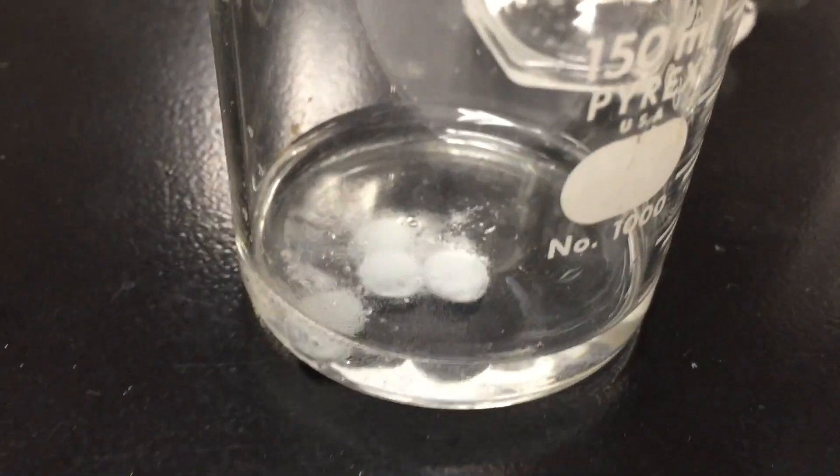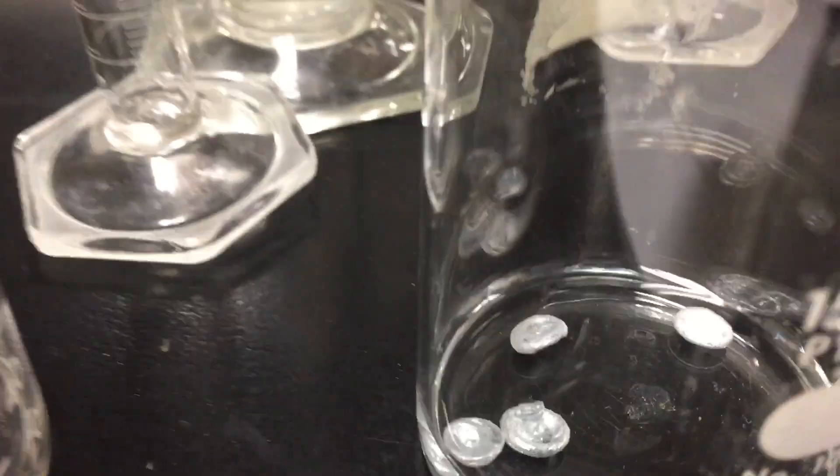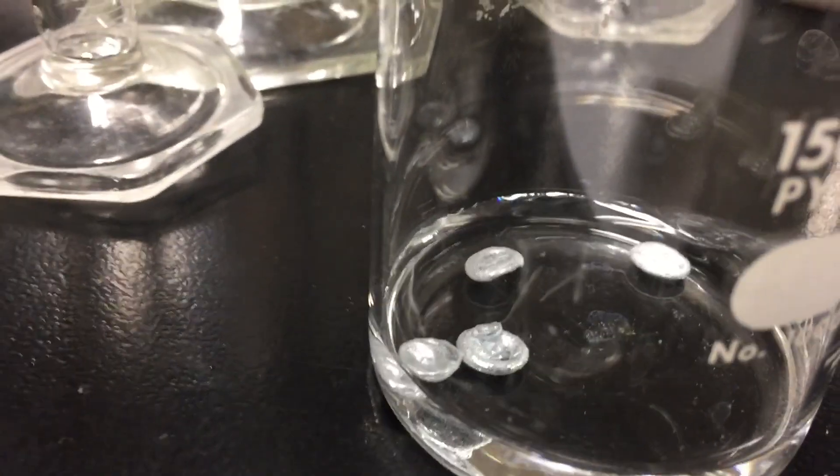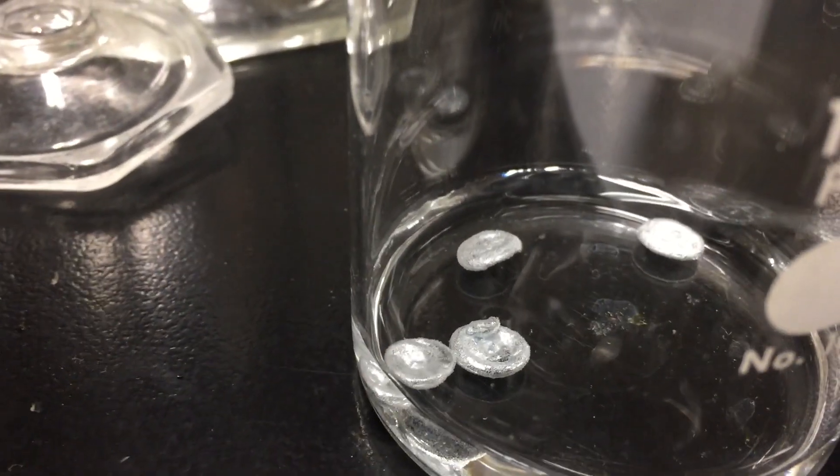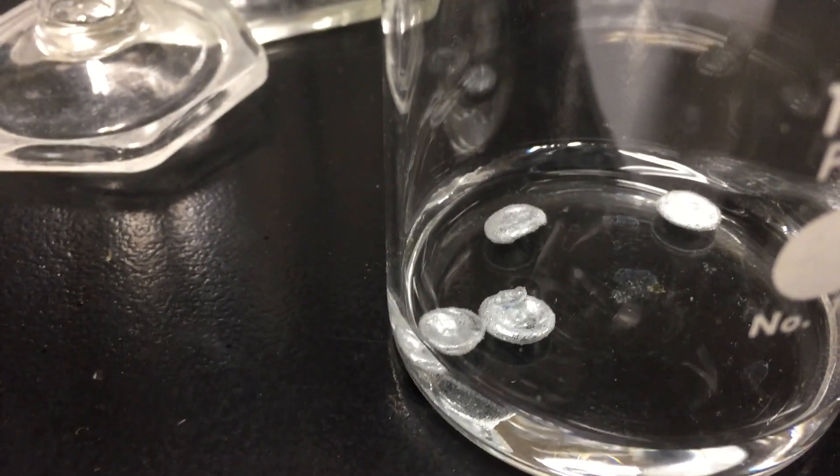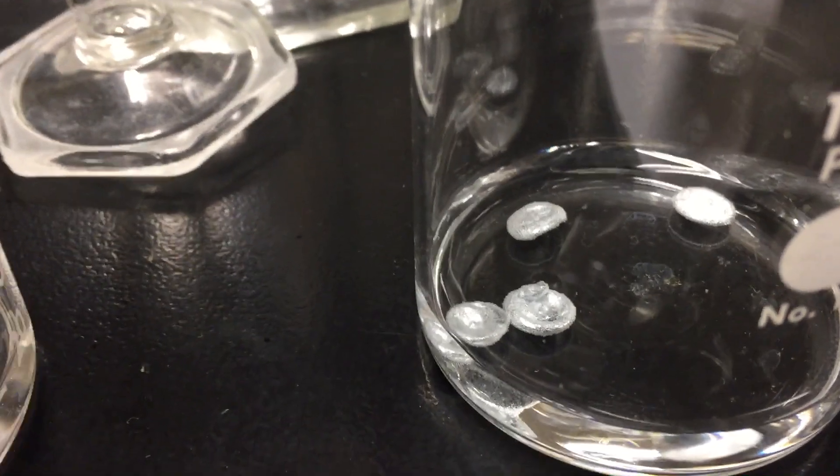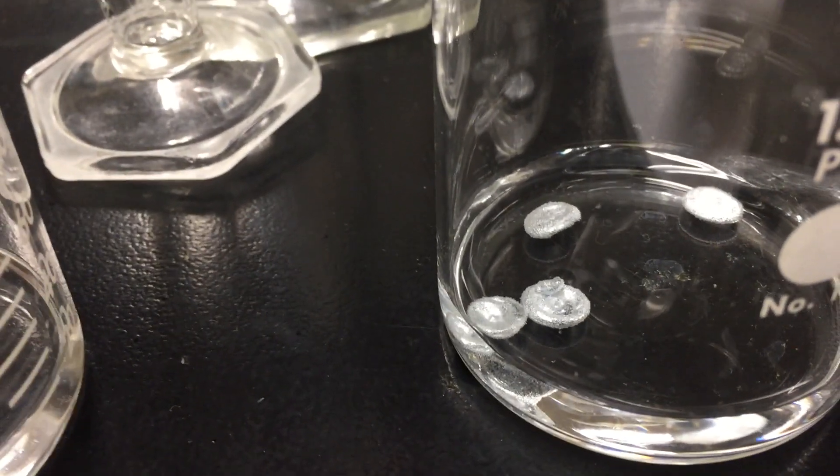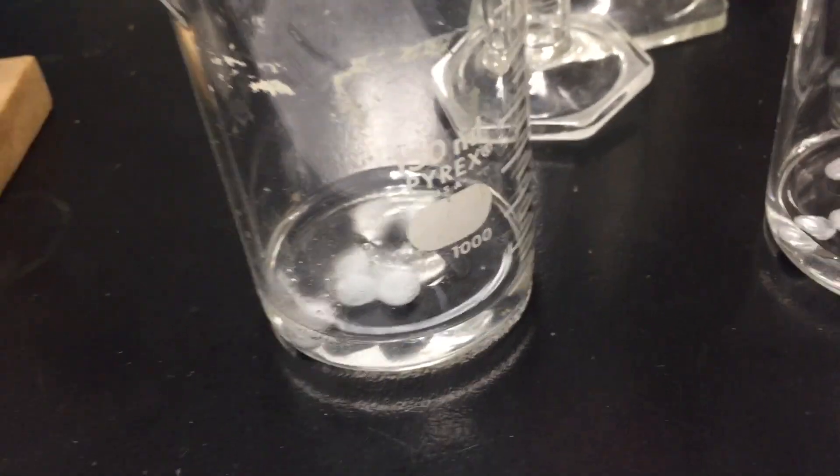So once again, here's the 6 molar reacting with the zinc ingots, and here is the 10-fold dilution, so this is 0.6 molar. And I imagine there's some reaction going on, but it's very slow. So the higher the concentration, the greater chance there will be for meaningful collisions between particles, and therefore, the rate will increase.